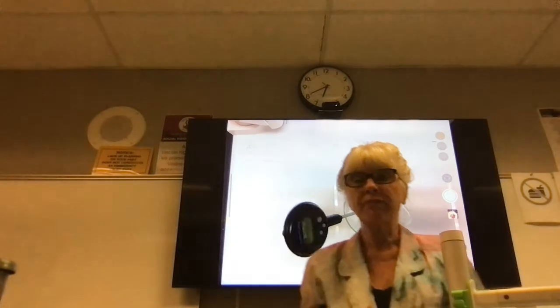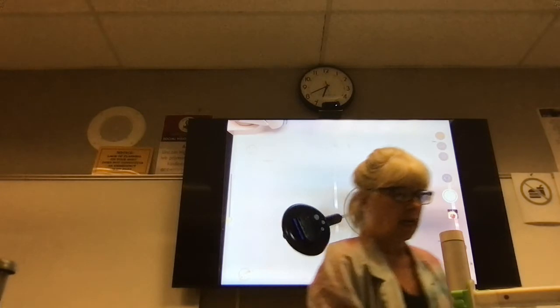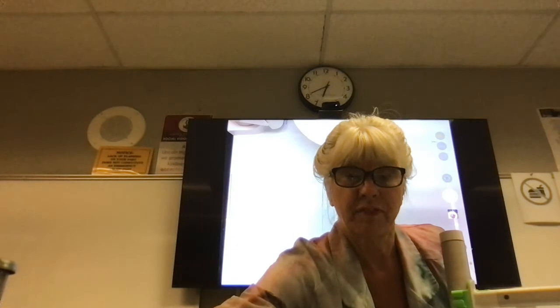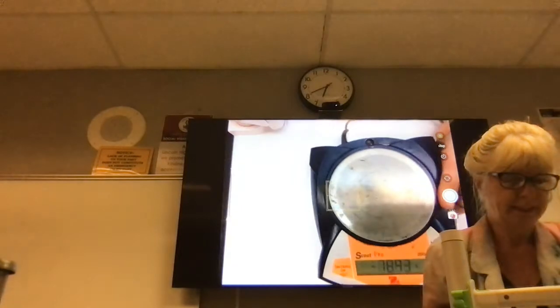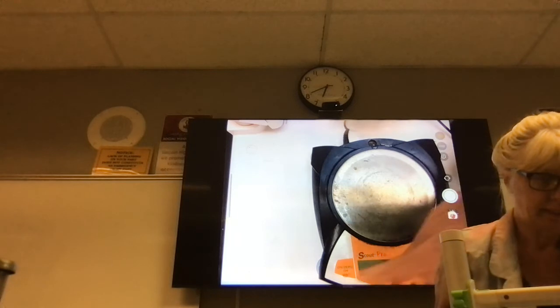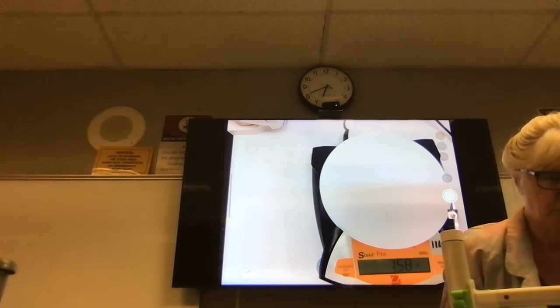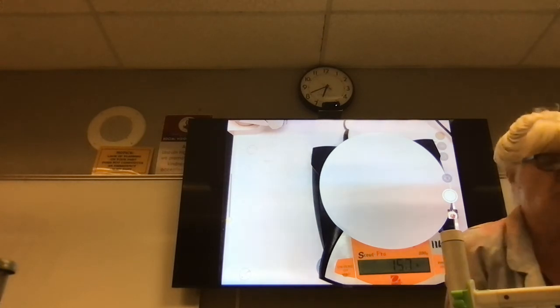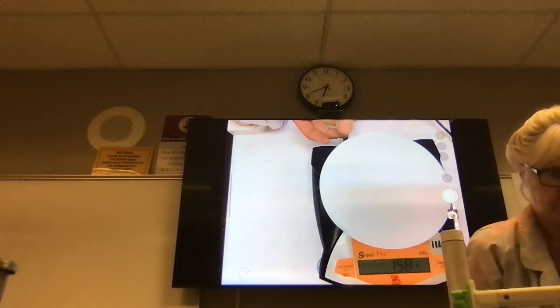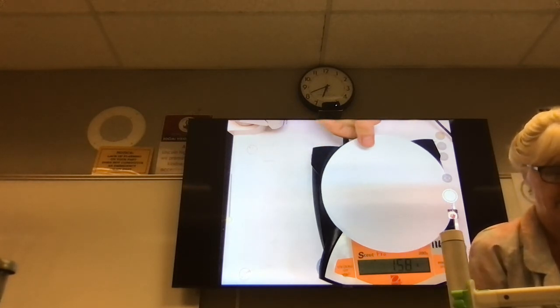In our next step, we have to measure the mass of a piece of filter paper. So I'm going to take this, put it on the counter while I find the mass of the filter paper. And here we go. And the mass of the filter paper is 1.57 grams. 1.58. It doesn't matter if you put 1.57, 1.58.